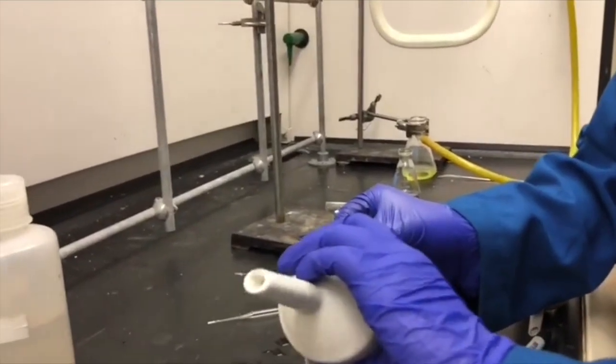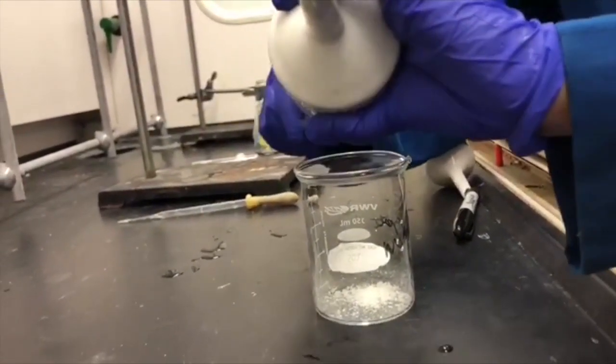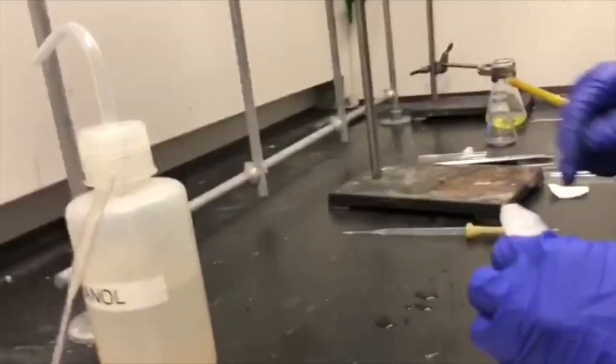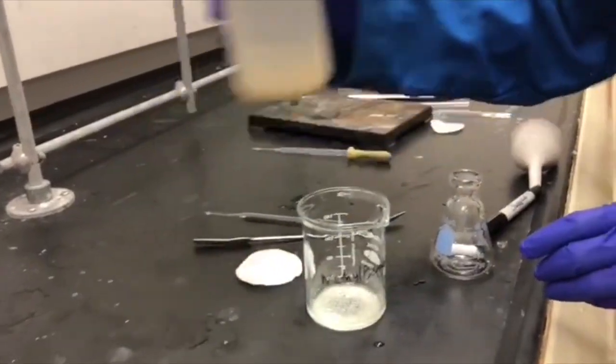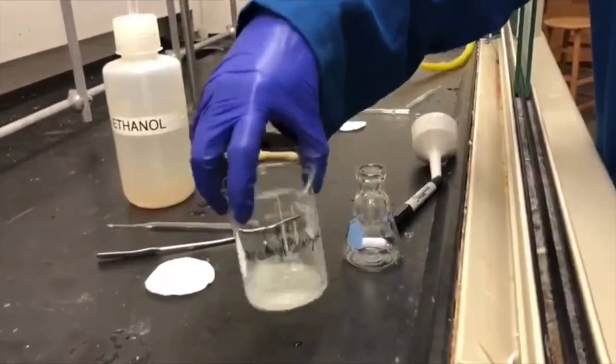I'm scraping off our impure product into another beaker. I'm dissolving it in 95% ethanol in order to do a recrystallization.